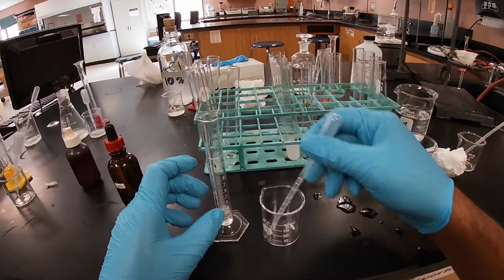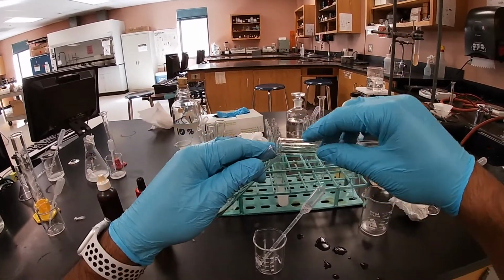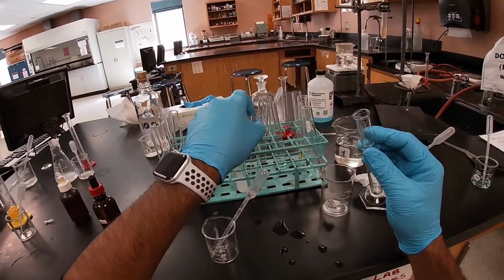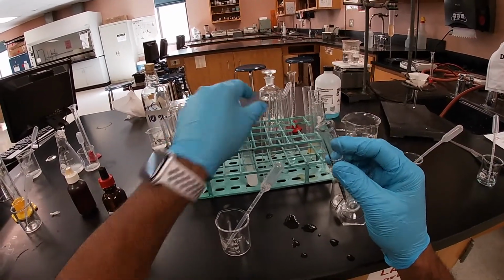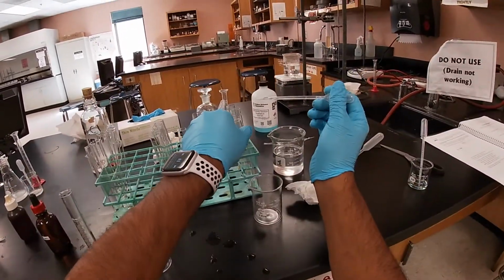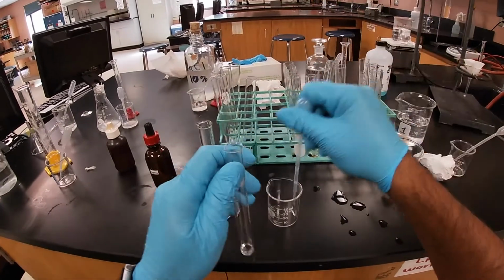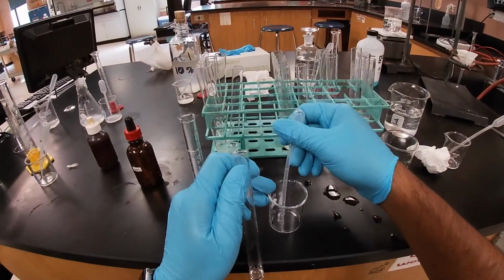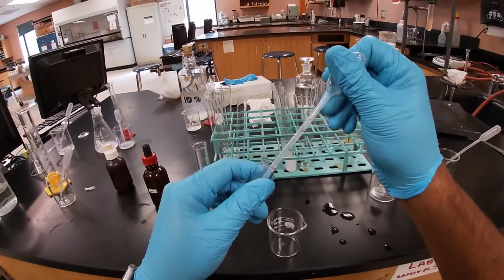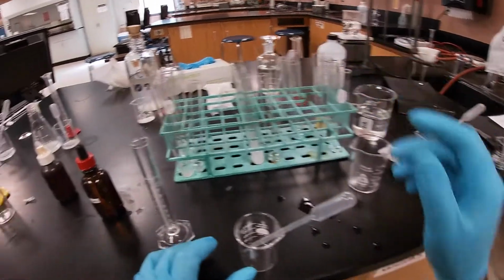Yeah, I think we should. All right, so this one we'll add to our other test tube, just so that we have enough of a sample. And then we'll add it to our final. We'll just add directly. There's no reason for me to measure it out. There's no more left. Like I said, it's kind of hard to get out 15 milliliters when they initially only get you 20.